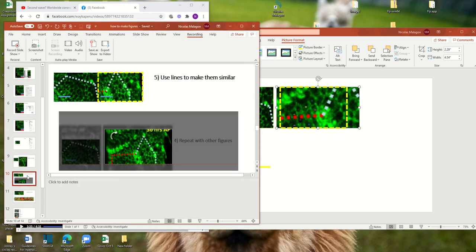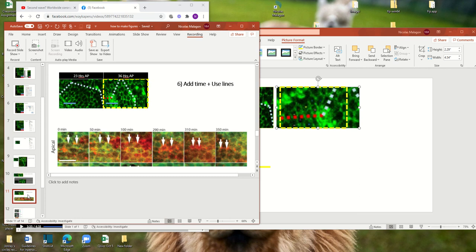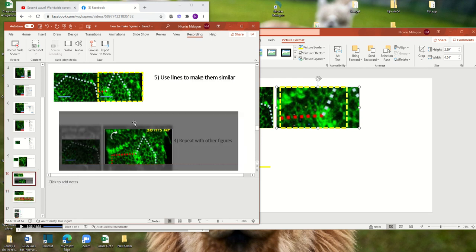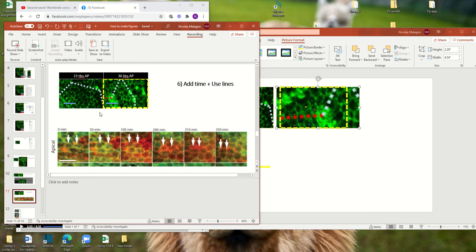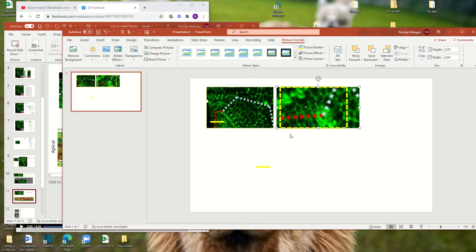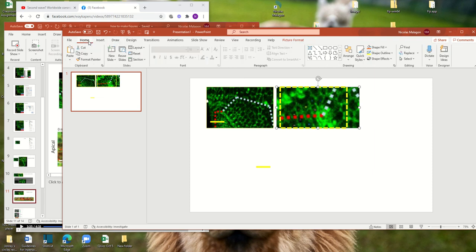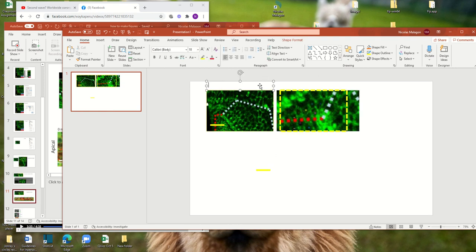So let's continue with the next section. And I already told you about choosing the lines to make them similar. So I'll show you these lines that are important. And here I just want to show you that later you can add the times, for example, 23 and 36. So this is wrong, but later I can show you, we can see how to correct it.